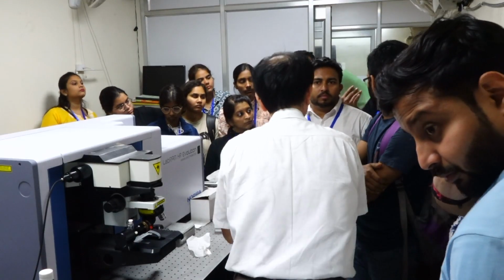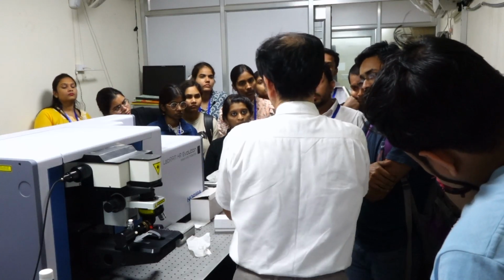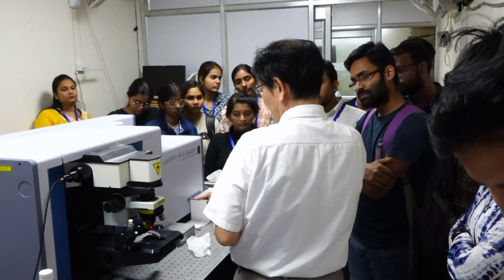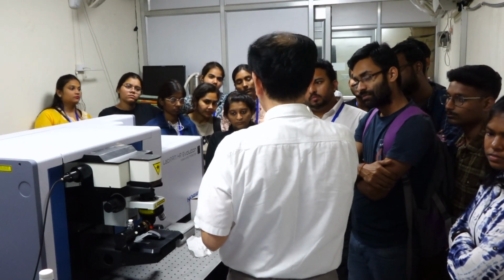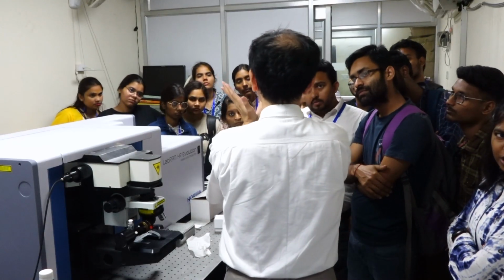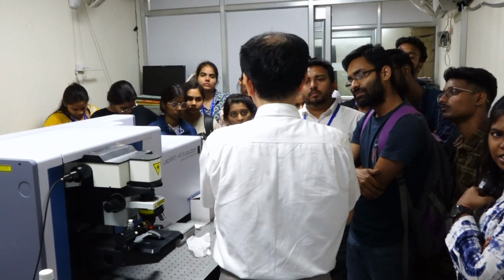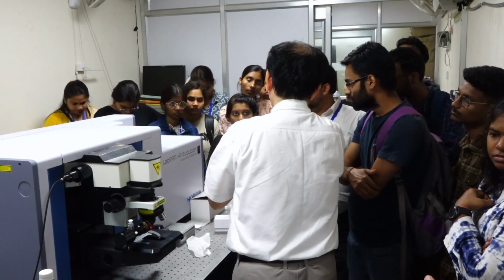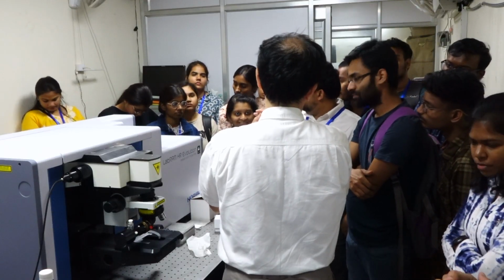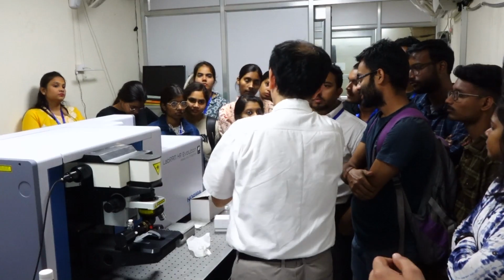How can we study biological molecules if the laser damages them? Yep. When we put the cell or living specimen at this point, the laser power becomes too strong and burns it. So to avoid such a situation, we lower the laser power. That's all we can do. Sir, can you repeat again? Lower the laser power.